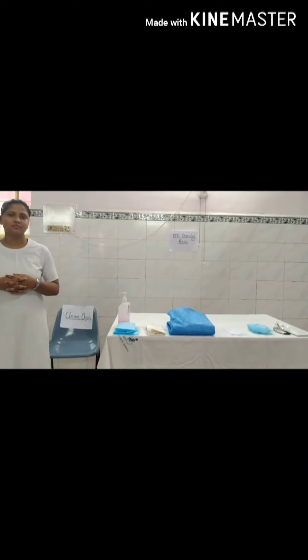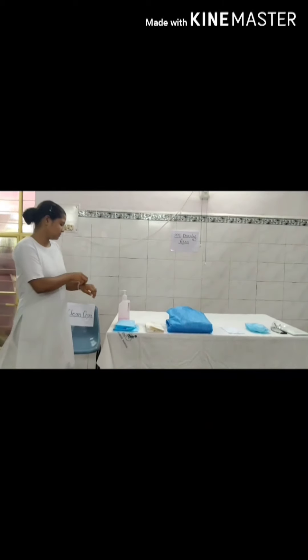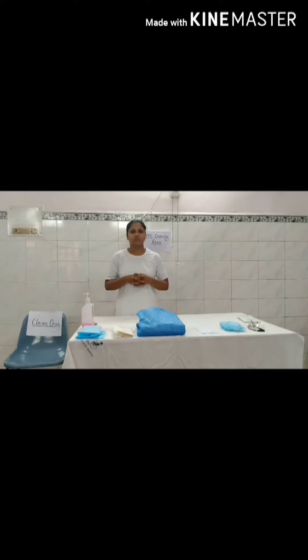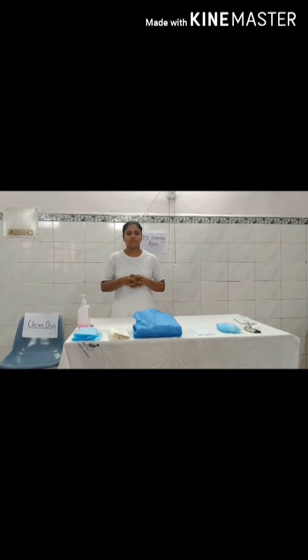For donning, we need one clean area. Remove all the ornaments like watch, ring, etc. Wear clinical dress. Now, check all the articles of the PPE kit.